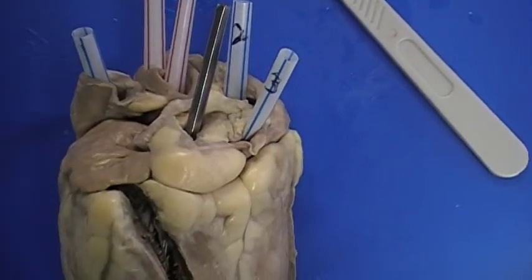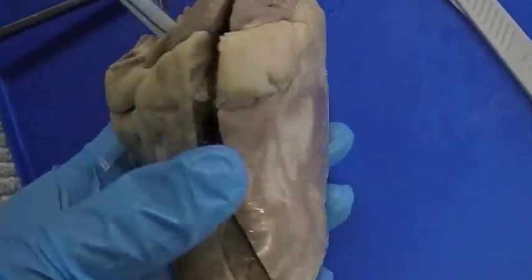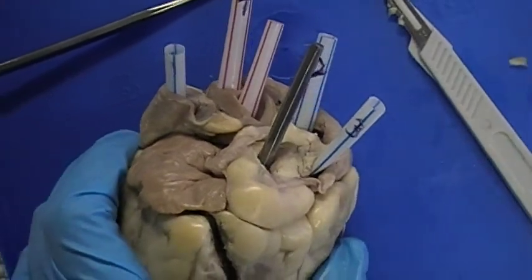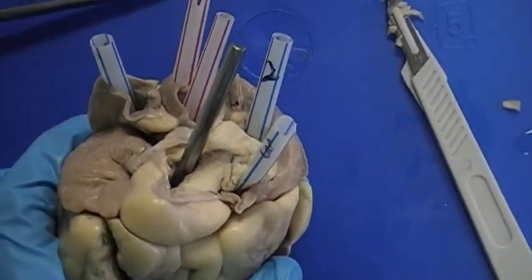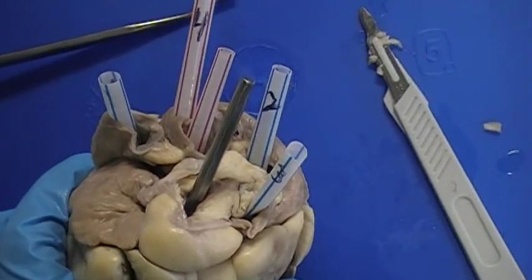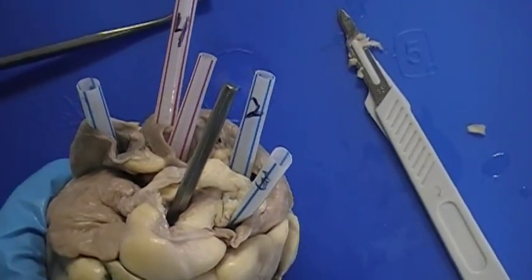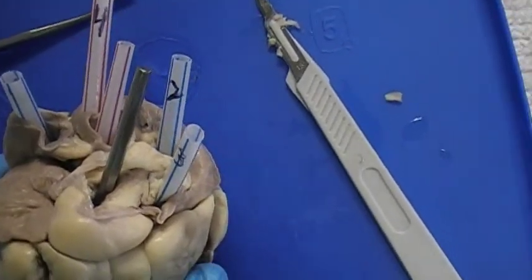And the coronary sinus I was unable to find as well. Kind of snooping around and couldn't find it. And all 3 of them dump into the right atrium. They are all veins, and they all are deoxygenated blood.